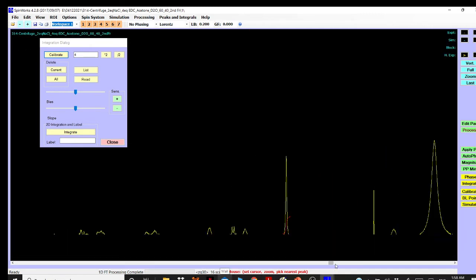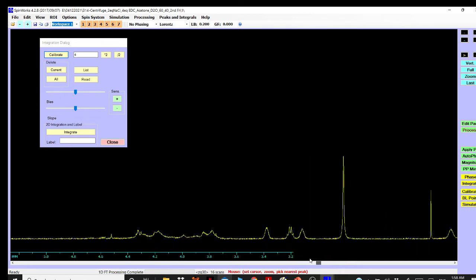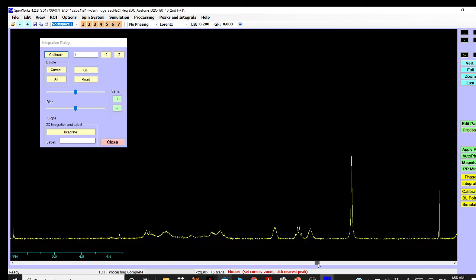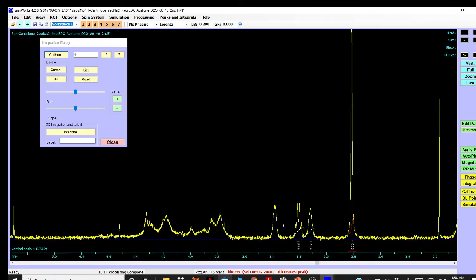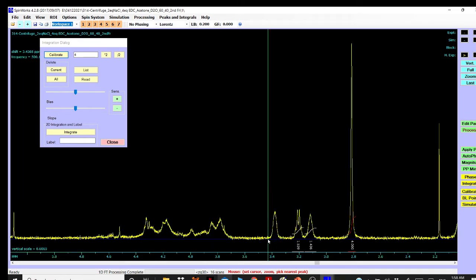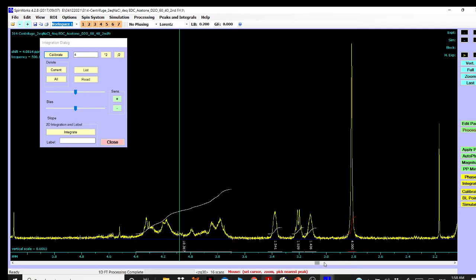Then you can also use this button to move the spectrum here and there, and since I already integrated this peak as 4 protons, I can select all the other peaks to see how many protons are for them. So you can integrate automatically by selecting all those peaks. If you want to increase the intensity, you can go up, and then integrate in terms of that signature peak. So you can select a certain region and see how many protons are giving that.